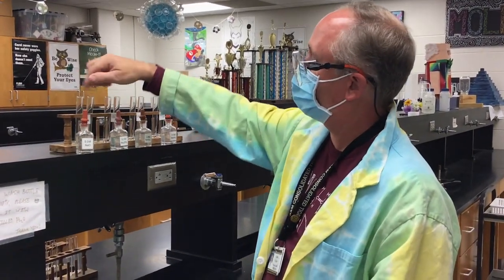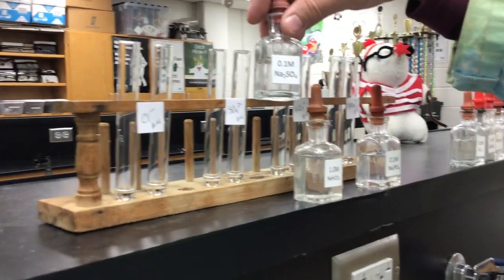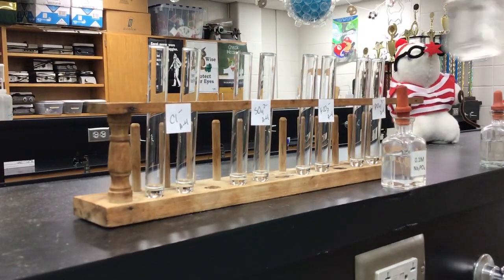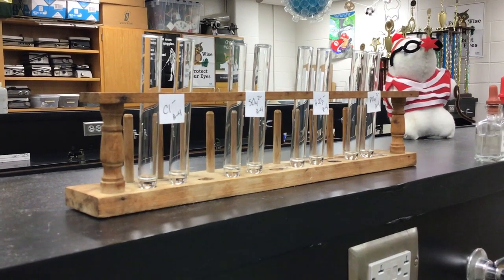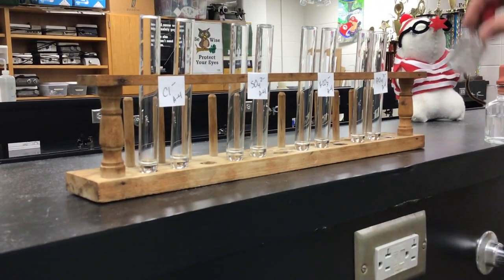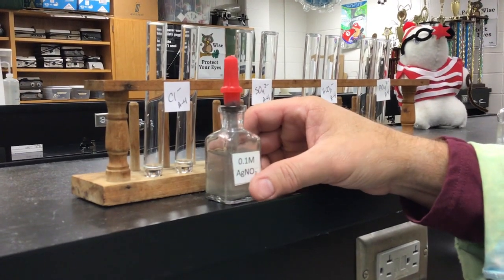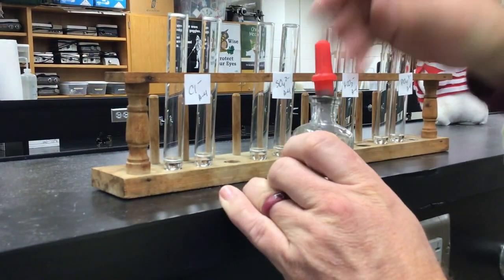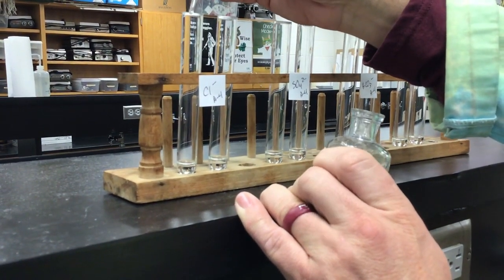So our known for this first one is going to be sodium chloride to see if there's chloride ions present. That way it'll give us a positive result. And then for sodium sulfate, and then I'm going to use bicarbonate for my bicarbonate anion, sodium bicarbonate, and sodium phosphate for my phosphate. And what I'm going to do is I'm going to add a compound that I know will produce something with a chloride ion. In this case, it's going to be silver nitrate. I'm going to add it here and then add it to the unknown, and you're going to compare the two and see if you see a positive or negative result.